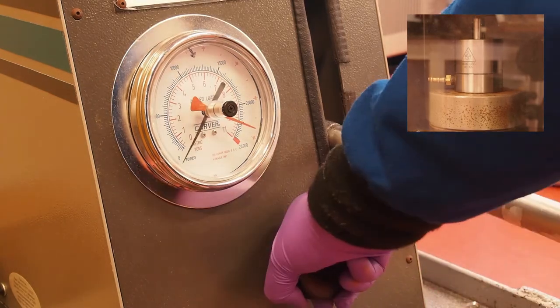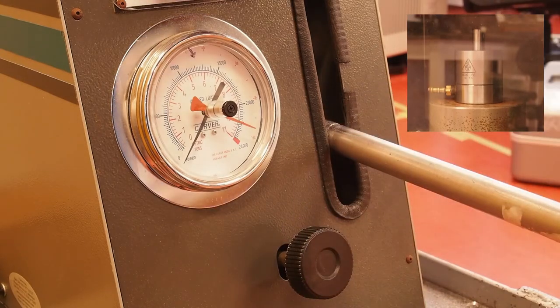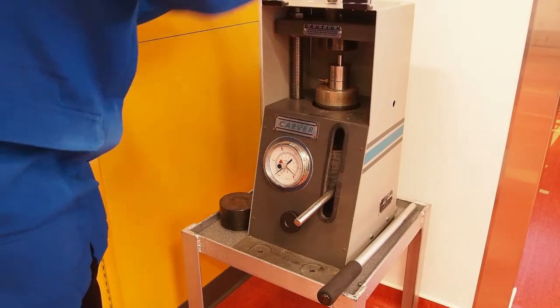Turn the pressure building knob counter clockwise to release the pressure. You can now unlock the safety shield and remove the pellet assembly.